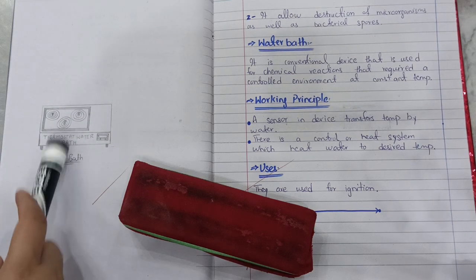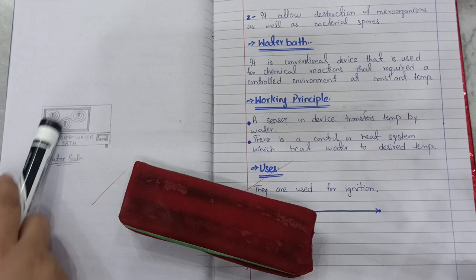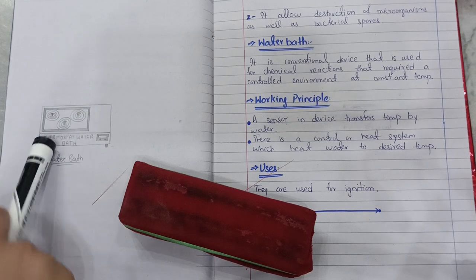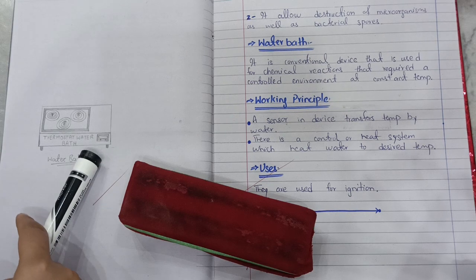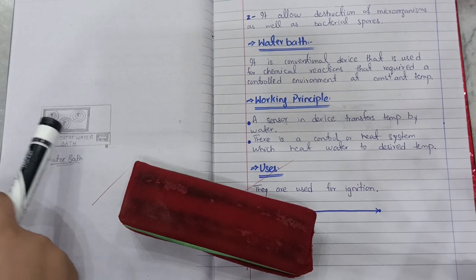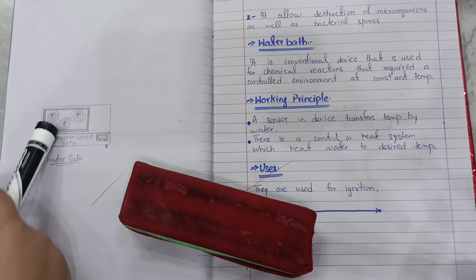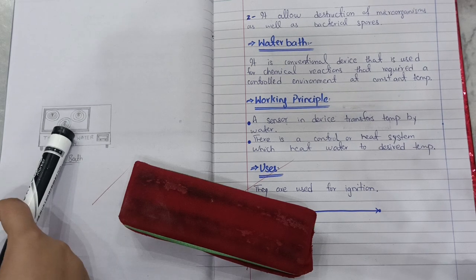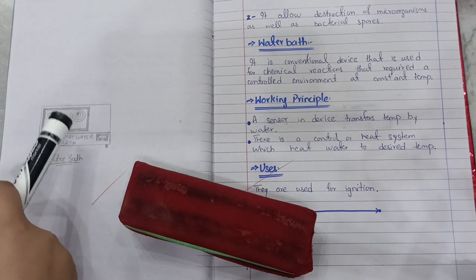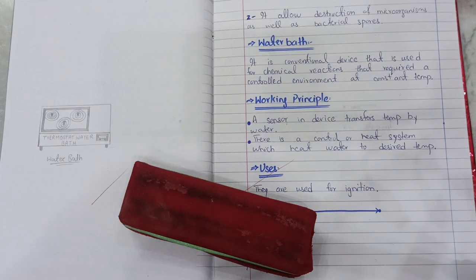ये आप इसकी पिक्चर देख सकते हैं. इसमें ये नेट से ये होती हैं, इनको हम उठाते हैं, जितना भी आपको साइज़ चाहिए होता है इसके अंदर हम वाटर पुट करते हैं, इसे टेम्परेचर सेट करते हैं. तो वो पहले पानी जो है वो गर्म होता है और पानी जब गर्म होता है तो वो हमारे इंस्ट्रूमेंट के साथ लगता है और उस इंस्ट्रूमेंट या ग्लासवेयर के अंदर जो भी हमारे केमिकल्स पड़े हुए होते हैं वो गर्म होते हैं और फिर वो केमिकल रिएक्शन परफॉर्म होते हैं.